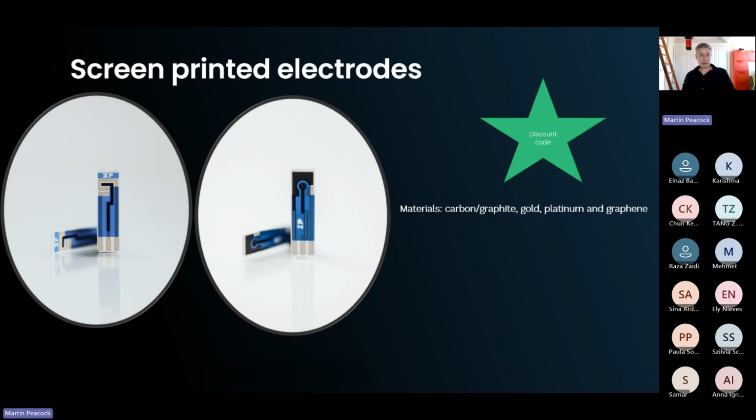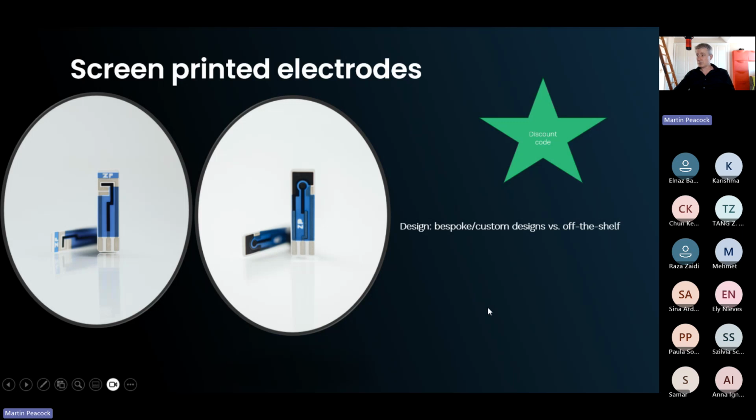Graphene's a material looking for application, but I don't think it adds a lot of value to biosensing. There's claims, but I can't think of any real commercially successful graphene-based sensors. There's plenty of people doing that work, I get it, but it doesn't really add that much technical advantage. And I'll show you some perfectly good cyclic voltammetry, not using graphene this afternoon.